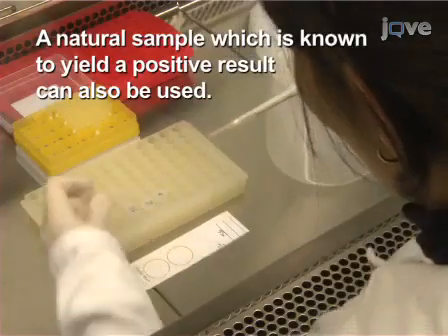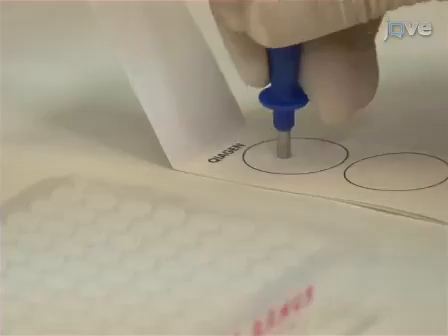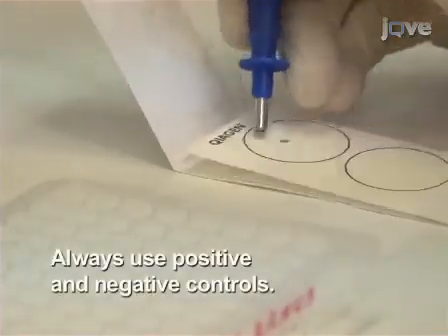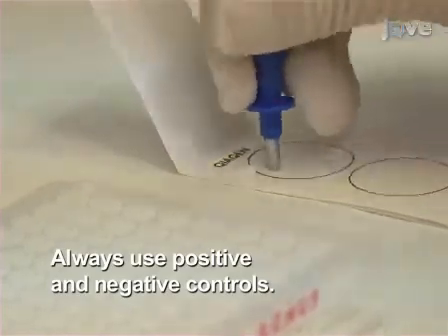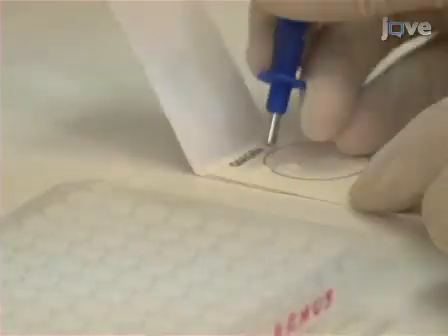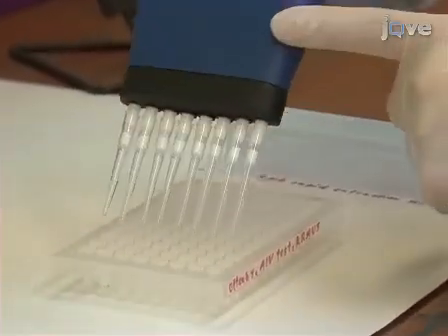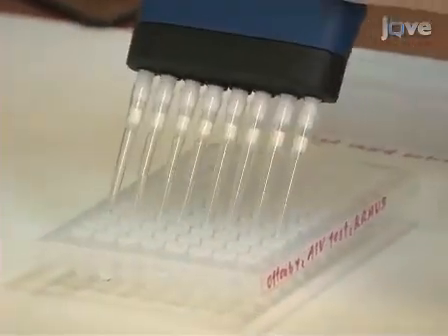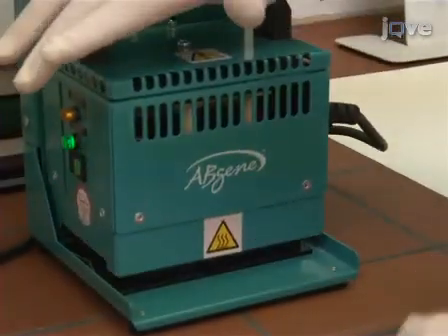To generate a positive control, apply a laboratory strain to an FTA card. As a negative control, punch out discs from an empty FTA card. Place these in the plate, as before. Be sure to leave another well free for a PCR control later in the experiment. Add 70 microliters of RNA rapid extraction solution to the well. Then, using a thermosealer, heat seal the plate.